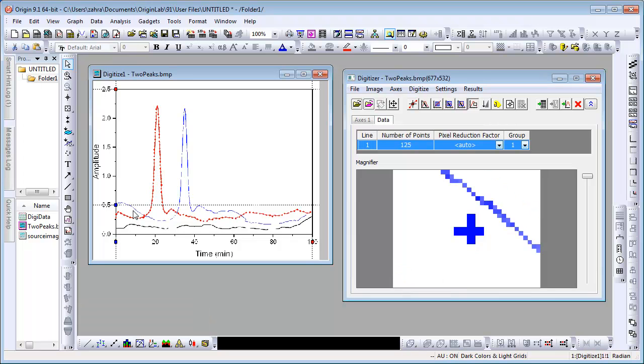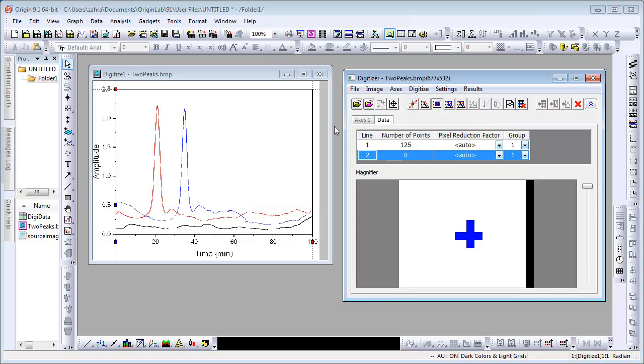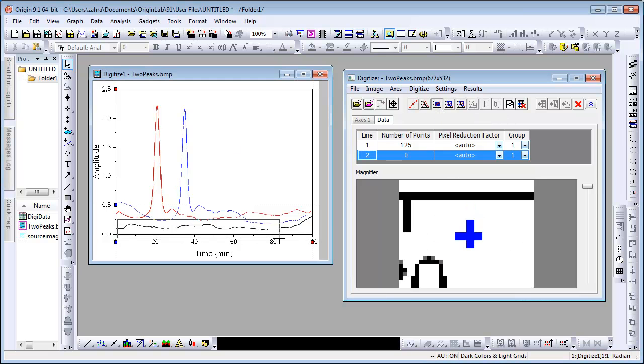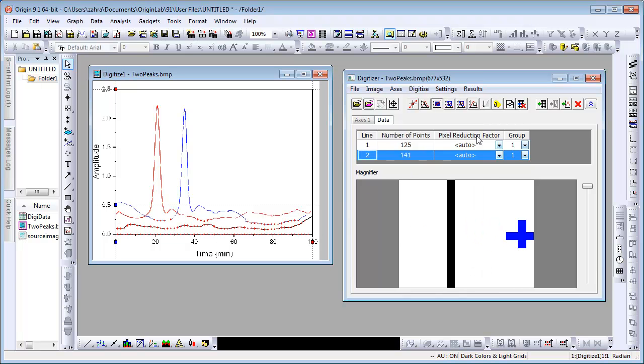We will now digitize the black baseline using a different method. Start a new line by using the New Line button. Click on the Auto-Pick Points by Grid button and draw a grid over the black baseline. If you are not satisfied with this line, use the Delete Line button to delete it.